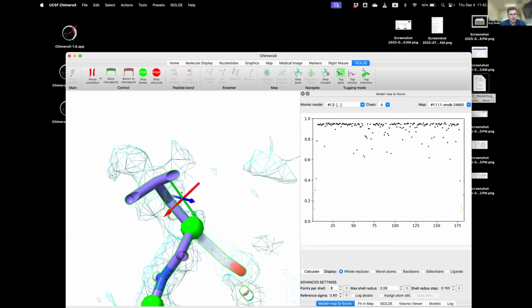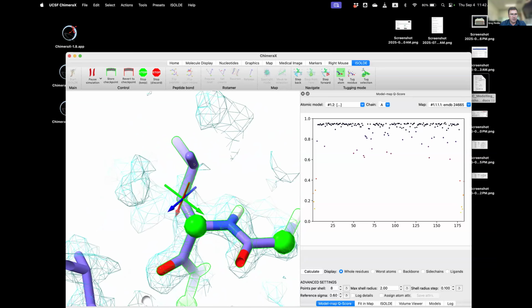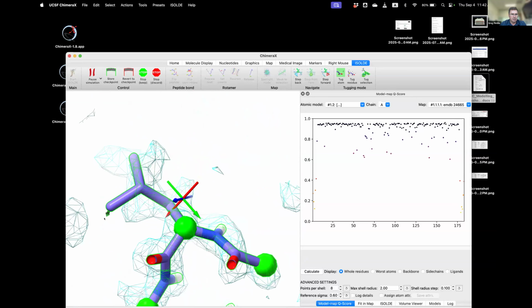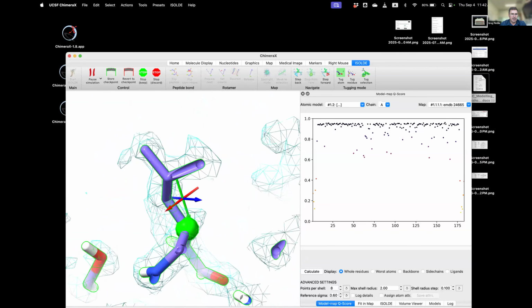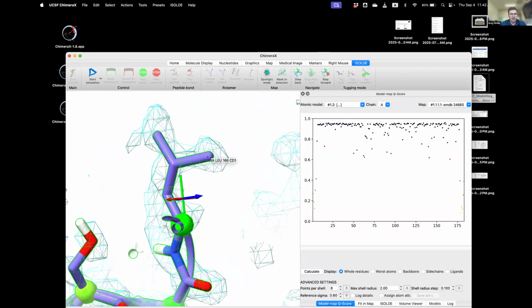Okay, now it's looking, you can sort of see how it's going into 3 different directions. So this is possibly an alternate conformer. Oh, it went away again. Yeah, you can see there's like 3 bumps here. So you can pick which one you want to fit. But once you've done this, okay, this was 166 I was looking at. So I think I was clicking on one of these points over here. Now you can see that point went all the way up there.